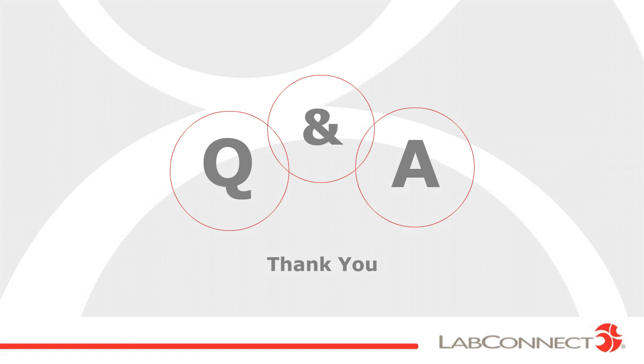It's something that they take a lot of pride in, and Lab Connect takes a lot of pride in. I can get you the details of the process, but I do know for sure that once the kit is built, there will be a review by another person on that team just to make sure that all the boxes are checked.